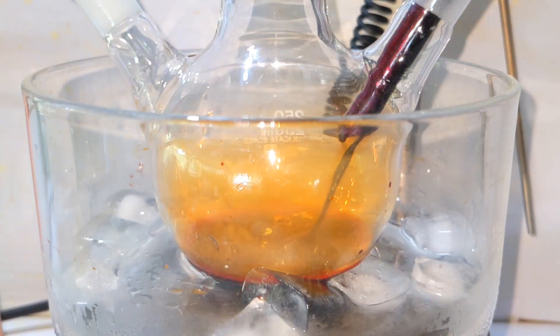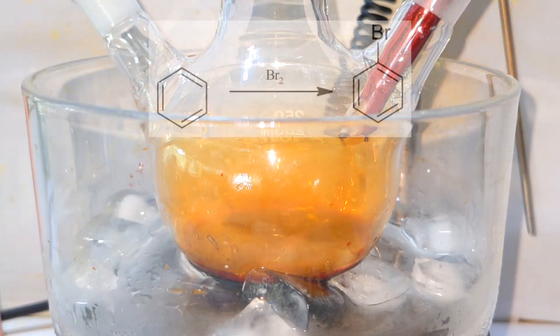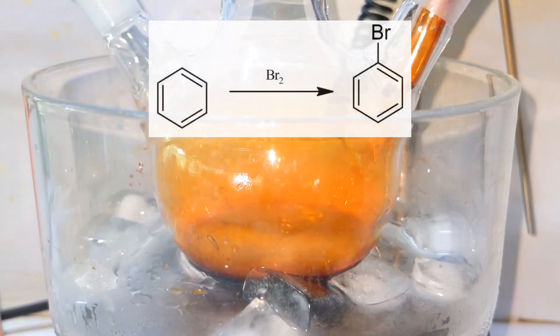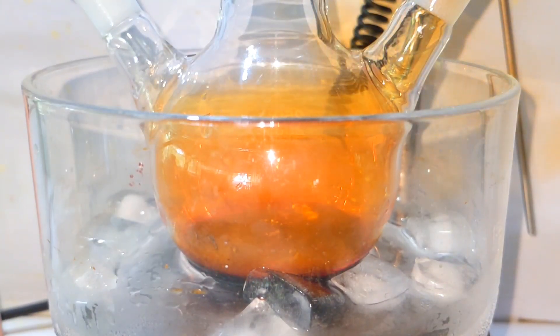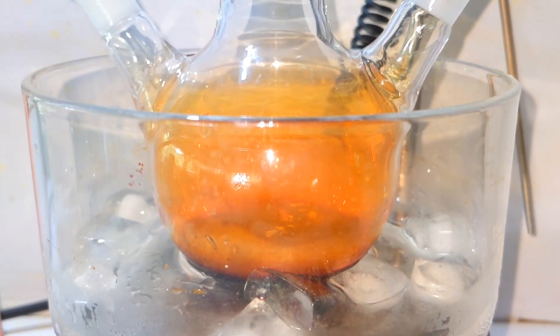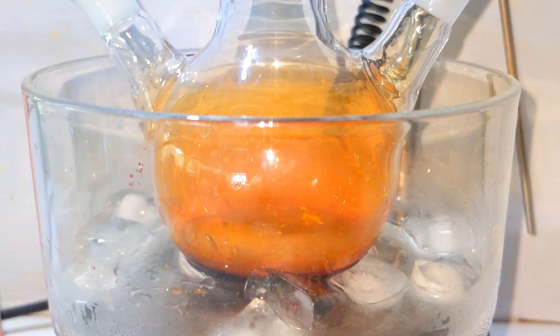Continuously stir until the vigorous reaction settles down. What is happening here is the direct bromination of benzene in the presence of a halogen carrier like pyridine to form bromobenzene and the side product hydrobromic acid. Hydrobromic acid is produced as vapors and collected through the rubber tubing into water where it dissolves.